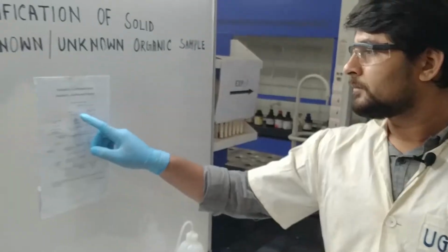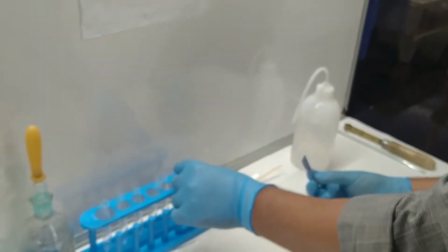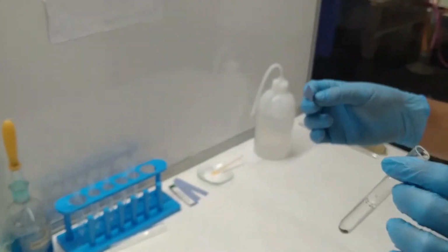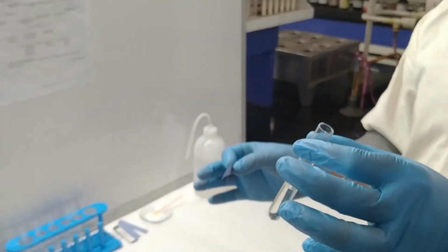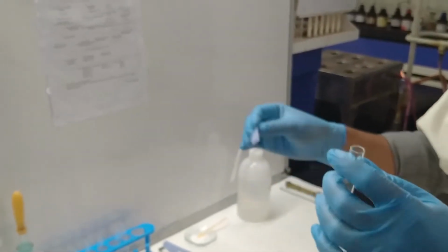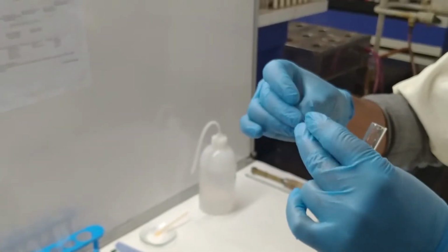Okay. So I take a blue litmus paper from here, and for this also we have to make an aqueous solution of glucose, water solution of glucose, but I already prepared this one in my first test, so no need to prepare again. I just use this solution. Now I just roll the paper like this way.